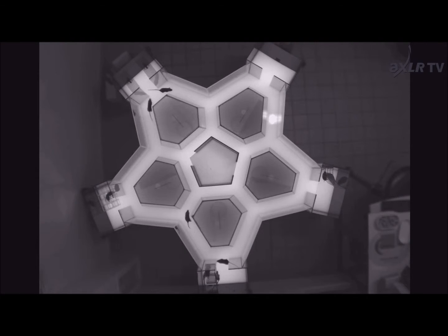In particular, it can be completely adapted because each house can be modified, so it's a particularly versatile apparatus.